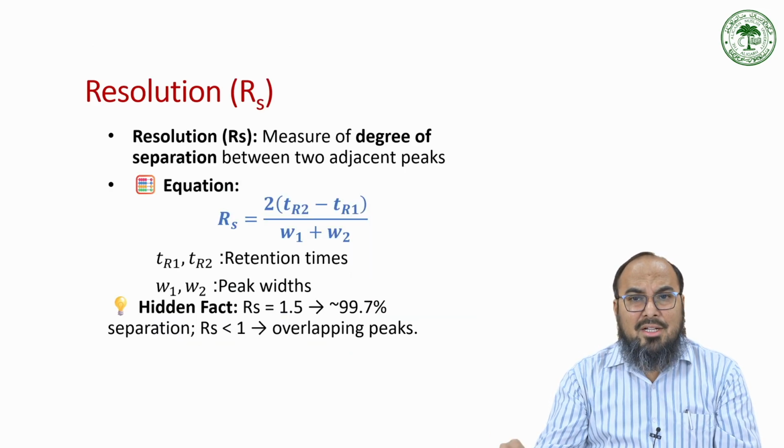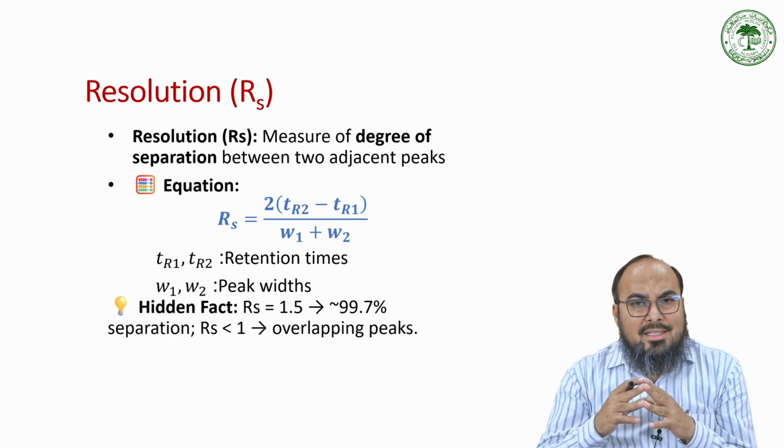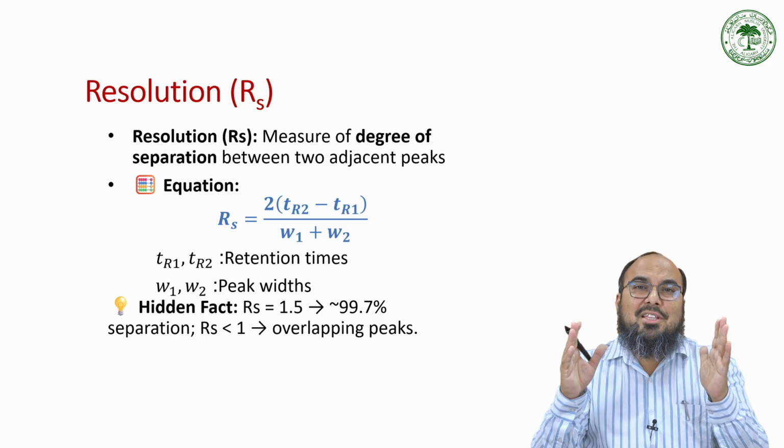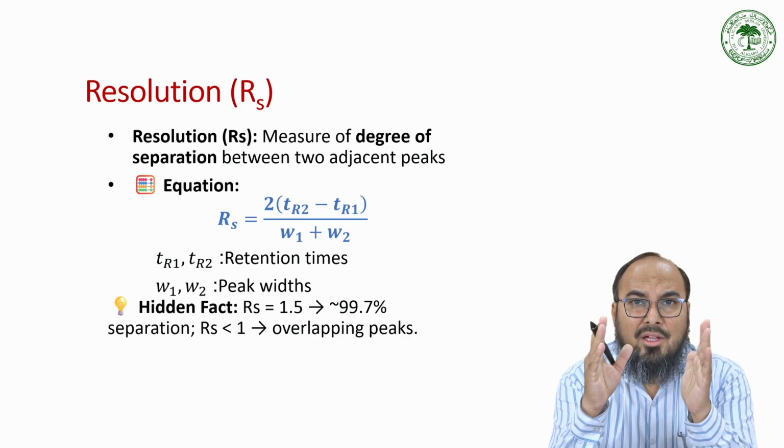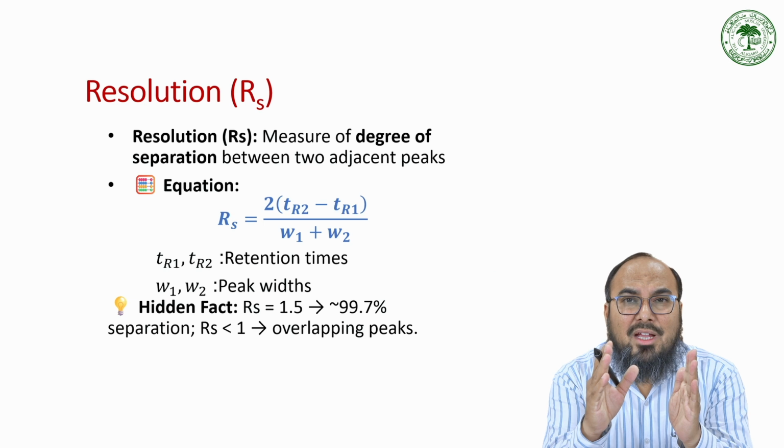So let us start with it. Here is our previous equation. Resolution can simply be defined as the distance between the two peaks, which arises because of the two components.